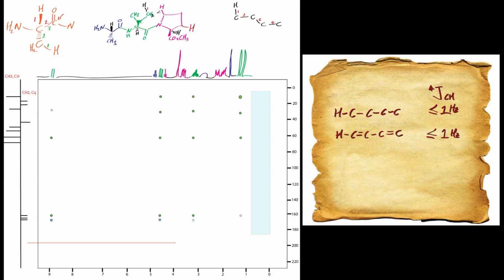So we've got a single bond there, hydrogen to carbon, then you've got another one, carbon to carbon, third bond is carbon to alpha carbon, and then you've got a 4 bond correlation from that proton to the carbonyl carbon. So I doubt very much you'll actually see that in a real HMBC spectrum, but I've put it in there just in case you do set that value. Okay, so that's why that one's shaded.